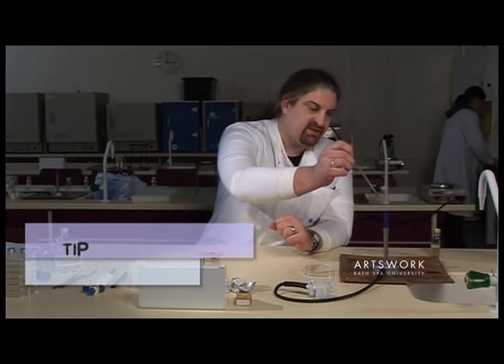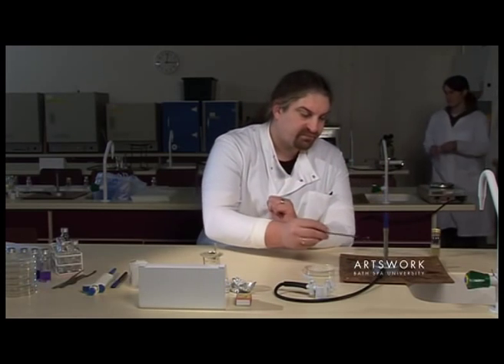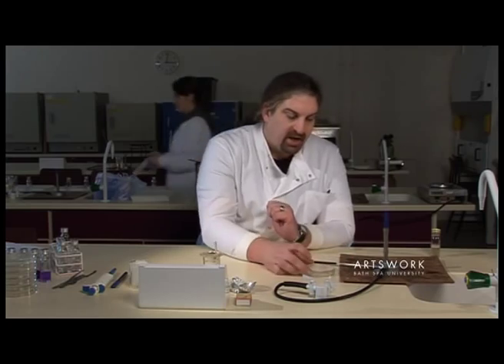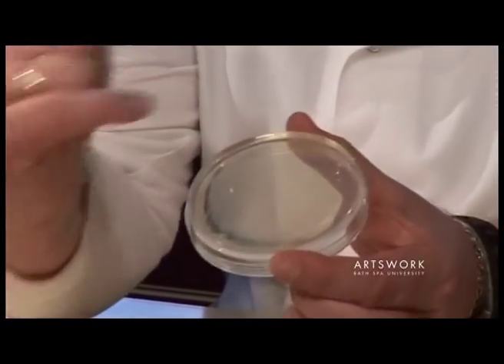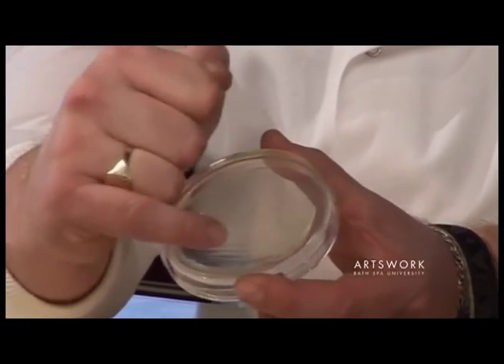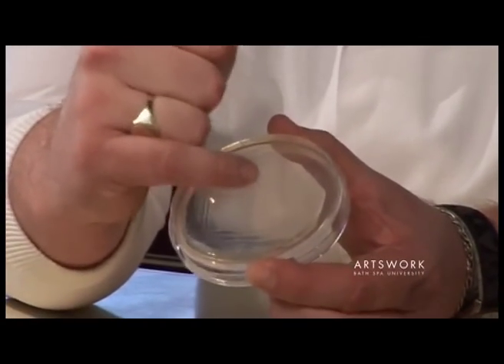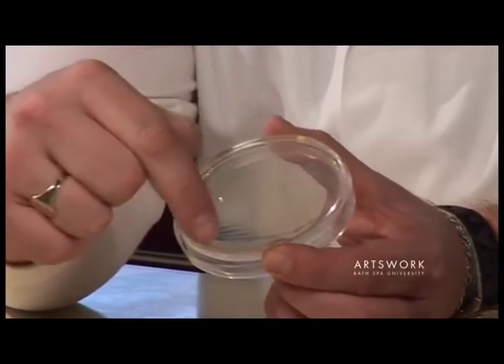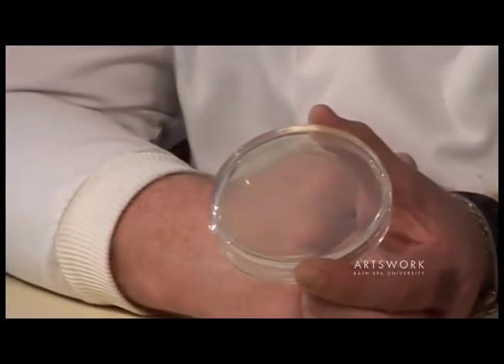Sterilize your loop for the final time, and that's your streak plate. Once you've incubated it, you should see individual bacterial colonies towards the end of your streaks. In effect, you're diluting out your culture as you streak it around the agar plate.